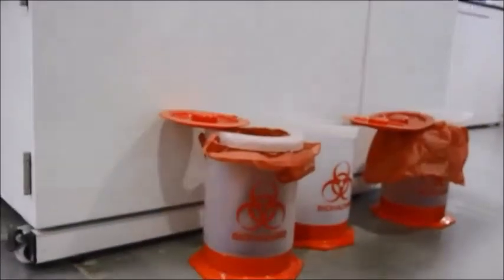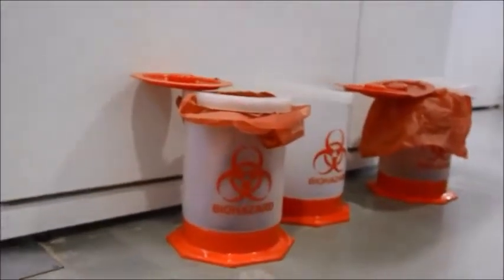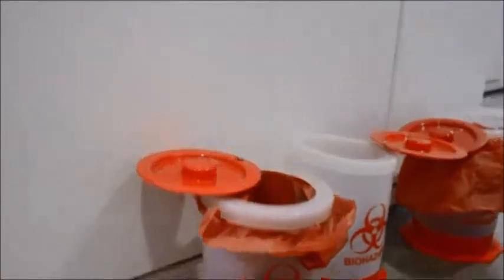Different kinds of waste are collected in different bins. Contaminated waste is one that comes in contact with the organism, the various cells and tissues that are bracketed as biohazardous waste.